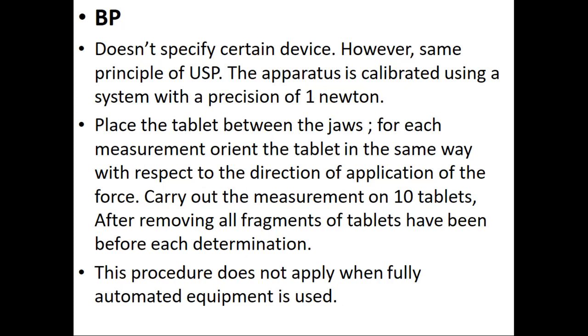We do the measurement on 10 tablets, after removing all fragments of tablets before each determination.